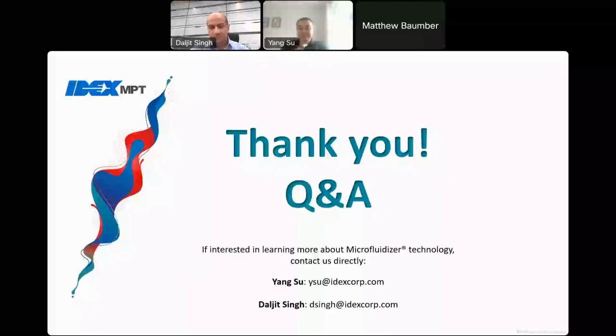Yeah, certainly. The way of using our technology to create solid lipid nanoparticles is done somewhat similar to creating the emulsion. Obviously, the system cannot process the solid lipid by itself. So usually you would have to heat up your formulation above the melting point of the lipids. Then the lipid becomes a liquid, and you can disperse that in the aqueous phase, then run it through our system, just like you are processing an emulsion. After processing, you will achieve a very small particle size of your lipids, and then you can cool the product, reduce the temperature, and allow the lipid to solidify, becoming tiny nano-sized lipid particles.